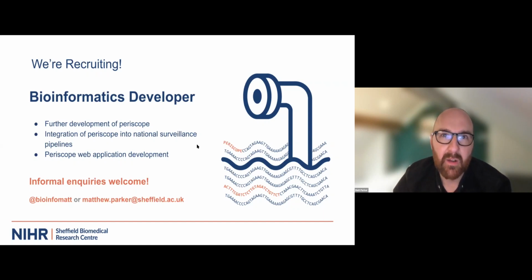But I think the way we think about it is these are the classical subgenomic RNAs with leader, and we really can't detect the other events. We probably would see those in the genomic data, right? We would see them as structural variants or big regions of the genome missing, but they're much more difficult to detect, and it's much more difficult to separate those out from artifacts introduced by chimera formation and stuff when you do library prep.